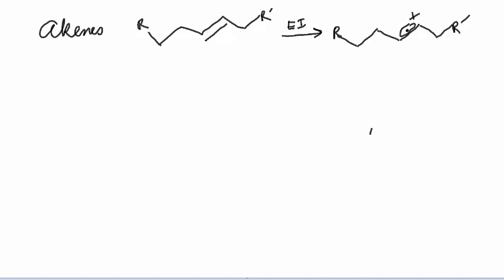We have this starting alkene. It's zapped with a stream of electrons. One of the pi electrons is removed. We have the radical cation formed here. And this is the pattern for alpha-beta allylic cleavage. Now, to illustrate that, let's rewrite one of the resonance structures for that.